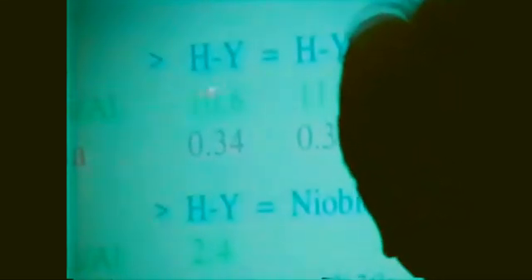Antimonic acid. And the interest when we have some zeolite solid is that the technique is really very sensitive, because you see it's possible to determine the coefficient of dissociation with respect to the silicon over aluminum ratio. And we see, for example, that the most important thing with zeolite, from the acidity point of view, is not the structure itself, of course, not the free space. You see that the most important thing is the silicon over aluminum ratio, much more than the structure itself.